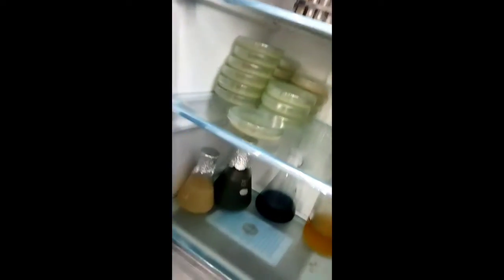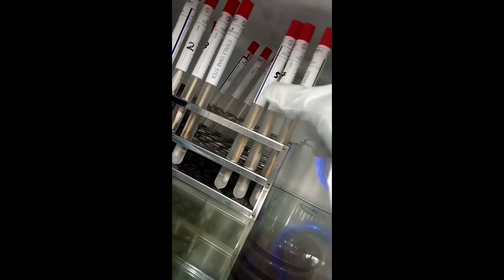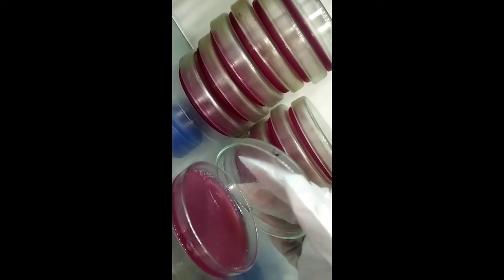What is inside the microbiology freezer? Here, this is the plate count agar for aerobic count. These are the sterile swabs for the sampling of any subject. Violet red bile agar for the enumeration of total coliforms and coliform.